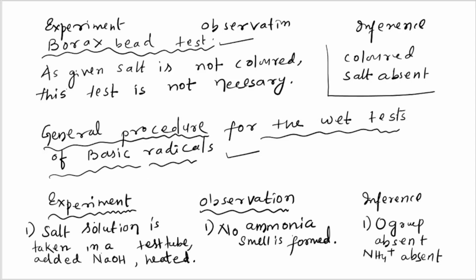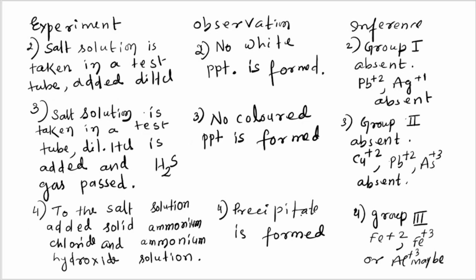Remember, very important, you should take salt solution. And here there is no ammonia smell because you are adding NaOH and heating. Then ammonium, NH4 plus, is absent. That means here that zero group is absent.